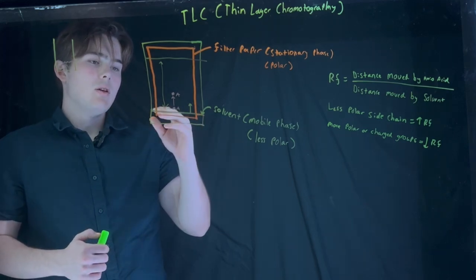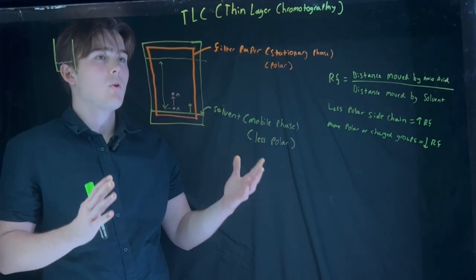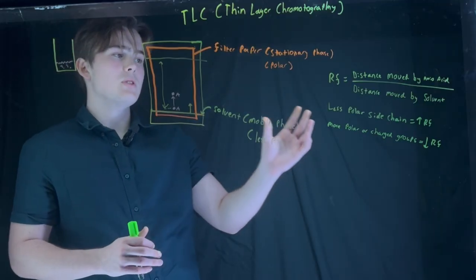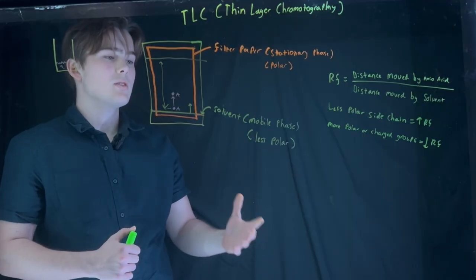So that's pretty much a quick summary of thin layer chromatography and what retention factors mean and what they can indicate. If you have any questions, let me know.